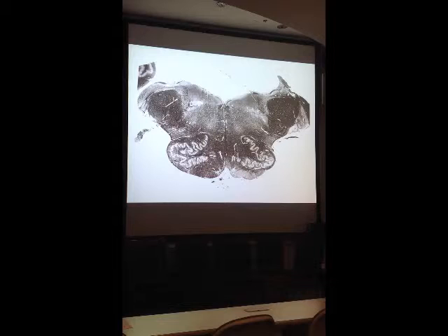You should also know that in the medulla there's another major ascending somatosensory pathway localized in this region. I can't see the exact border, but what major ascending somatosensory pathway is localized in this region on both sides? It's the spinothalamic tract, right? Also known as the anterolateral system, which is a fine name. The fibers of the spinothalamic tract relay information of pain and temperature, and some crude touch, from the contralateral side of the body. So that's the spinothalamic tract. Now, again, here's the fourth ventricle.